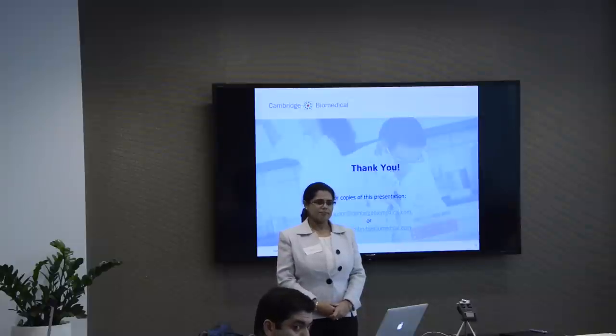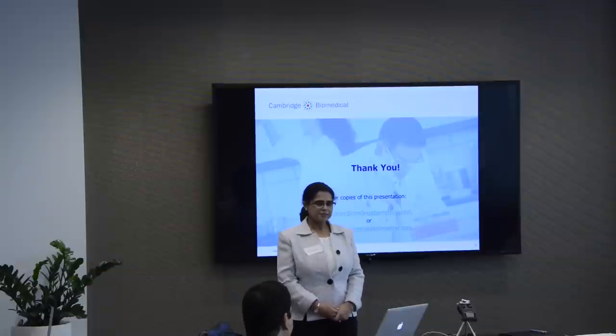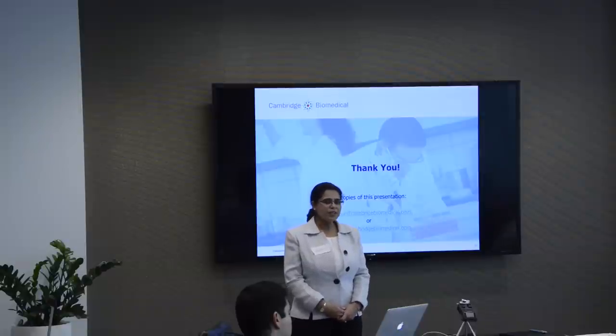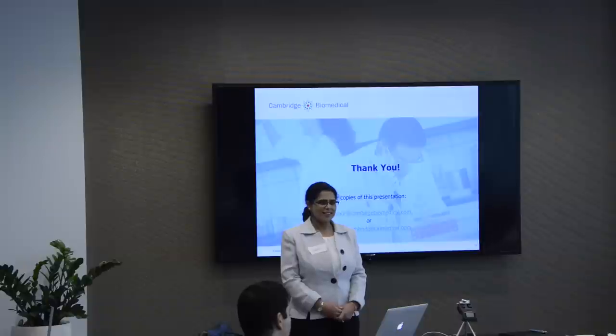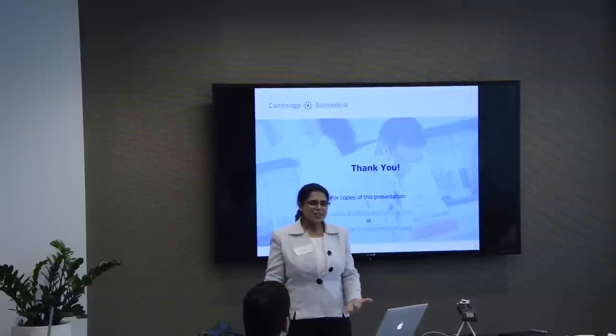Because she brought up a very important point, which is that there's going to be batch effects from day to day, operator variants and things like that. Yes. So does the FDA have recommendations for multiplexing? They don't have particularly for multiplexing. They have guidance for bioanalytical testing, but not multiplexing as such.